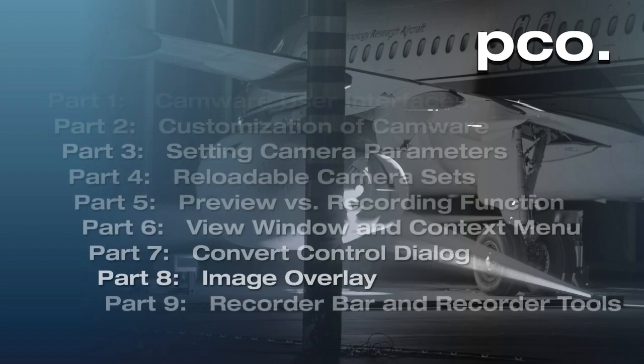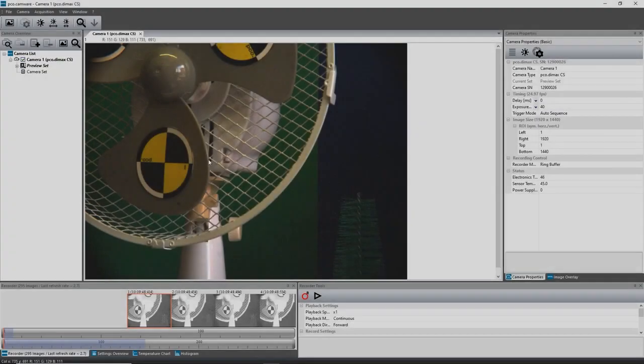Tutorial number 8, Image Overlay. Hello, and welcome to the pco.camware video tutorials. This video explains the Image Overlay function.